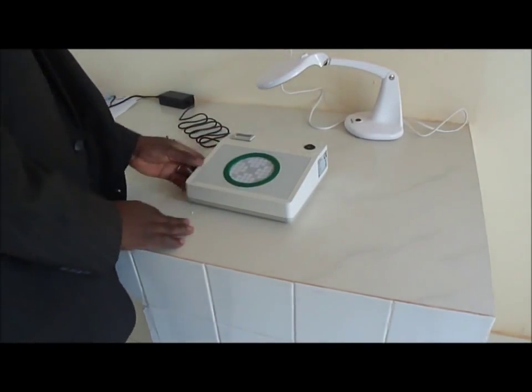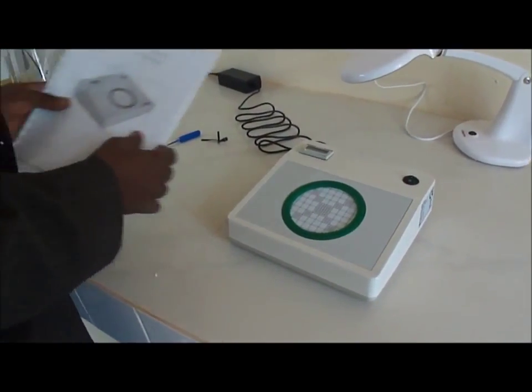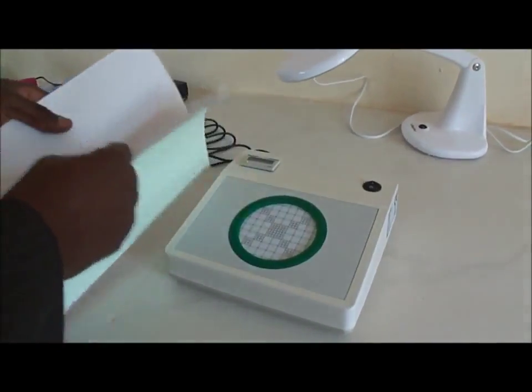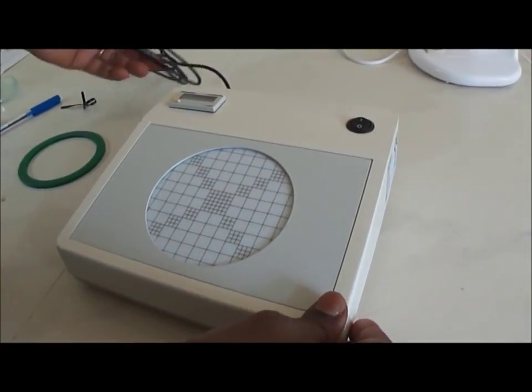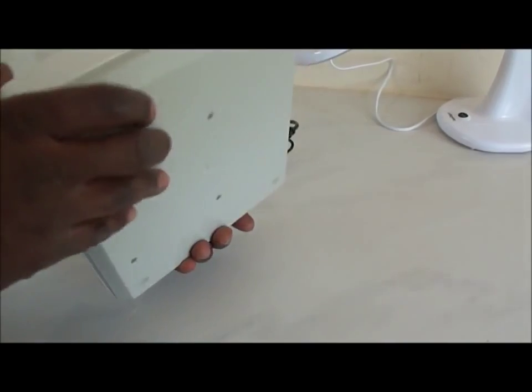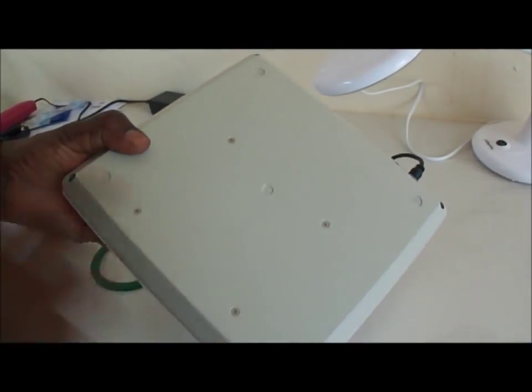In this video, we want to explain how the device called the colony counter, the Astor 20 colony counter, works. When you receive the device, it comes very simple, with an electrical wire adapter, of course. At the back here, you see the consumption is very low. It's on the side, you can see it, 2 watt.